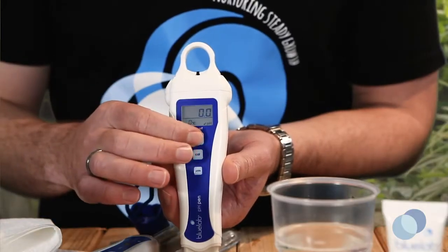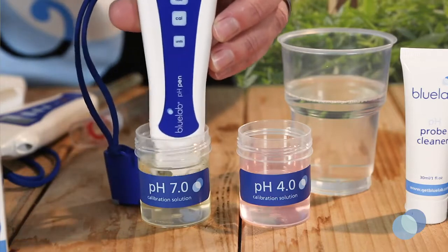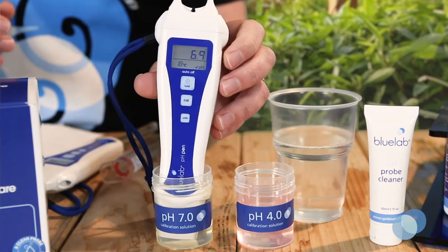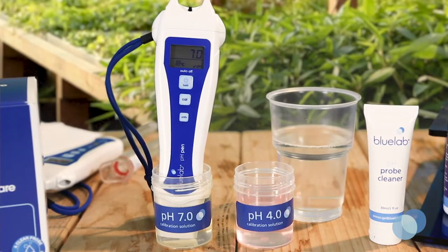Press the power hold button to turn the pen on. Place the probe tip in fresh Bluelab pH 7 calibration solution. Give the probe a gentle swirl to ensure you've got good contact between the probe glass and the calibration solution. Wait until the reading stops moving.